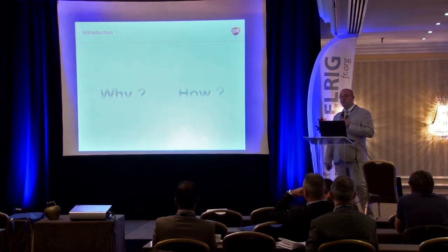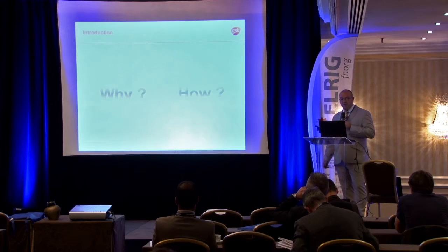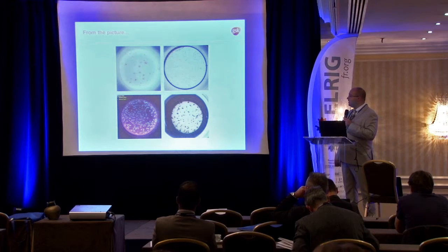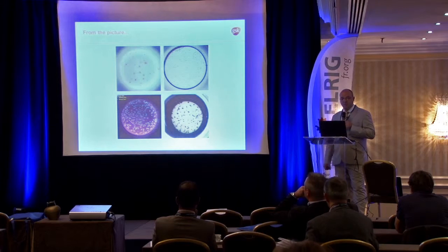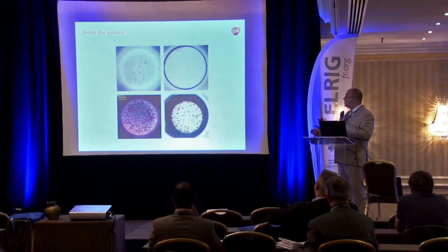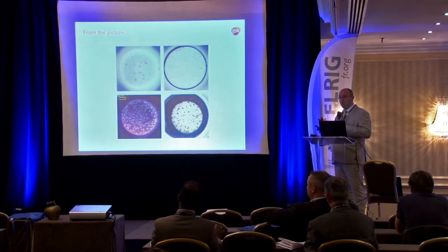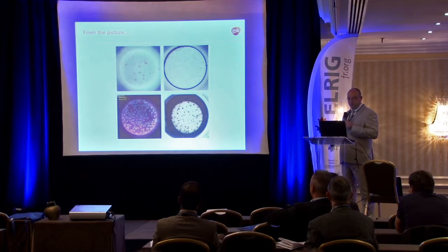In this presentation we'll talk about why we have been driven to develop a multi-application system, and how we did it. The story always starts with the same thing. The scientist comes to you as a support team and asks you to take a picture of his test, whatever it is. Here you can see a spot, cell-based, it could also be agar overlay, whatever you can do in these labs. You can take the picture for him, so that's a good one.